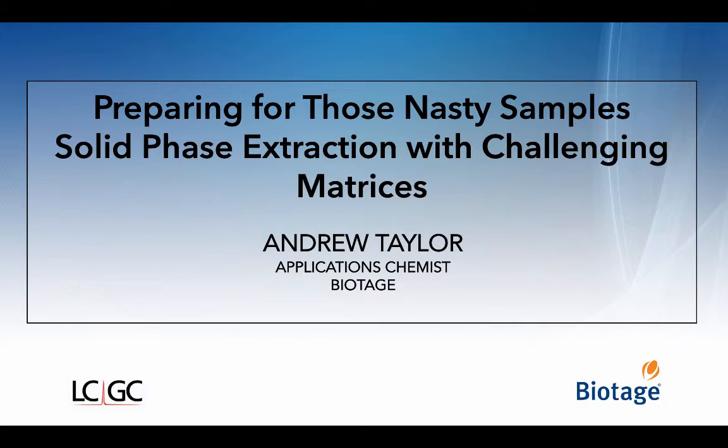Well, so when we're preparing a disk for extraction, what are some of the things we should consider? When you're preparing a disk for solid phase extraction, you really need to examine the sample matrix first. The first thing you want to look for is clarity. If you have a transparent sample, this makes life a lot easier. You can visibly see what particulates are in the sample, if there's any at all. And in that case, you may not even need pre-filtration. But in contrast to that, if you have a completely opaque sample, then you're going to need a fair amount of pre-filters built in so that you can ensure that the sample can process through.